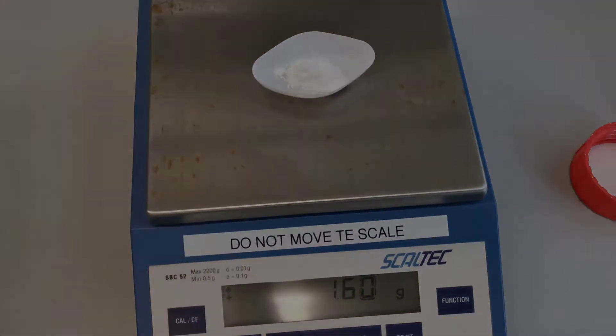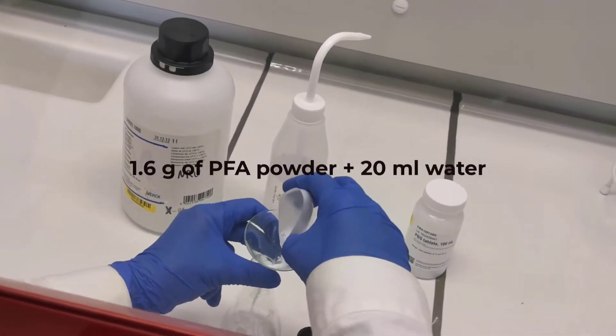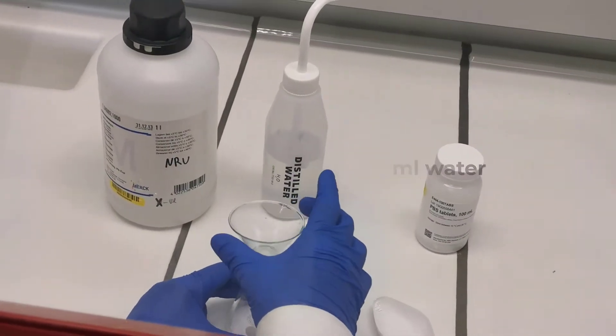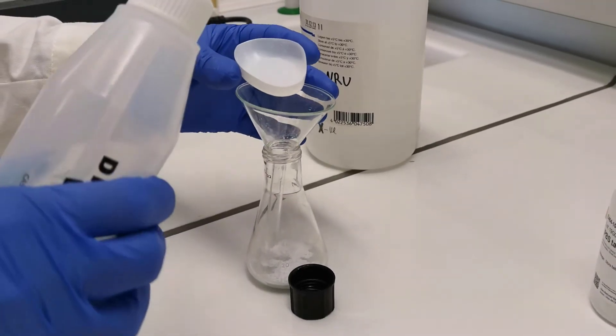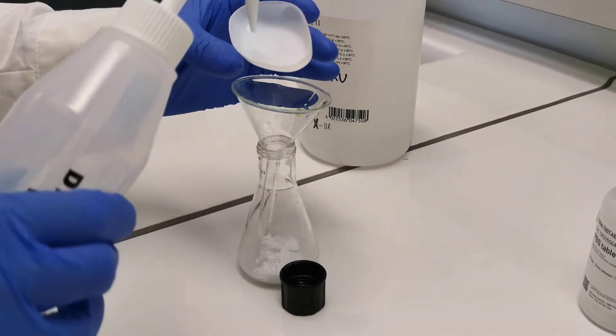For this demonstration, we are making 40 ml of 4% formaldehyde, for which we require 1.6 grams of PFA powder. First, we will dissolve it in 20 ml of double-distilled water in a flask, and then we will make it up with another 20 ml of phosphate-buffered saline at the end.